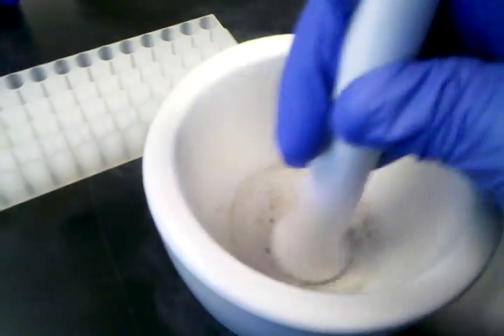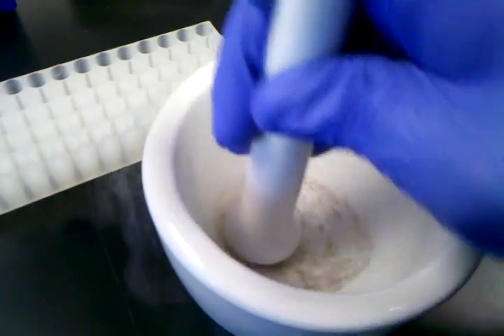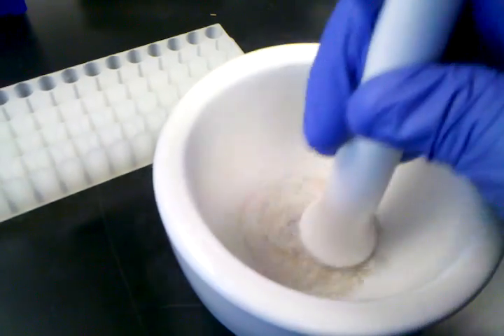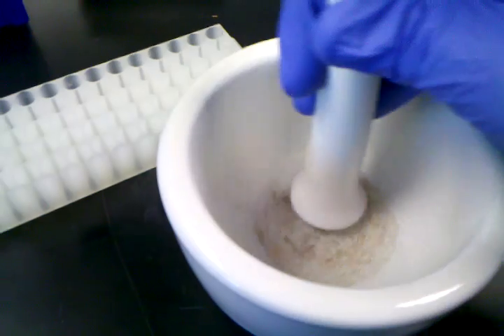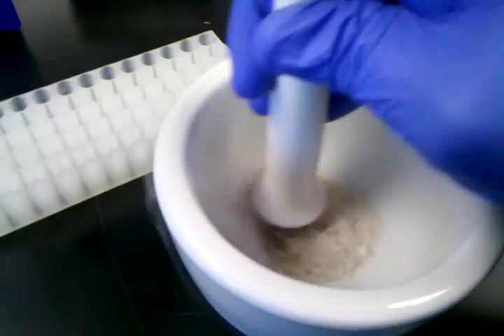The small pieces of the roots will sink down to the bottom of the liquid nitrogen. As you continue to grind, it will slowly turn into a powder. As you can see now, the smallest pieces of the roots are starting to get ground.